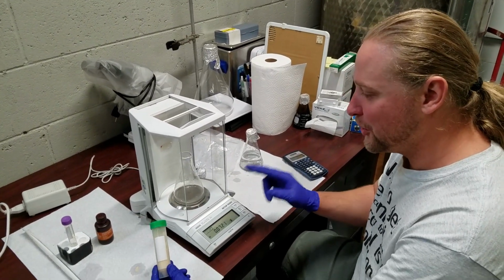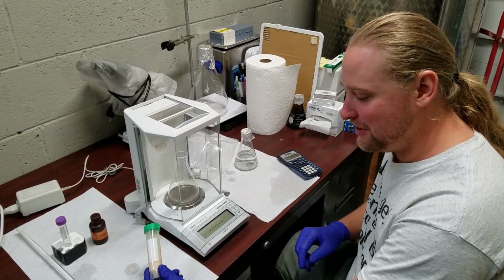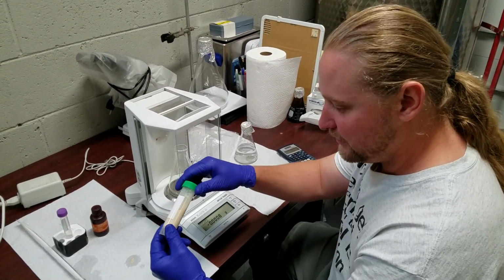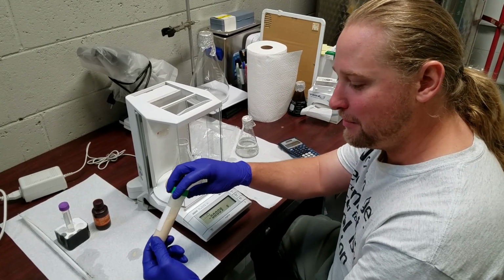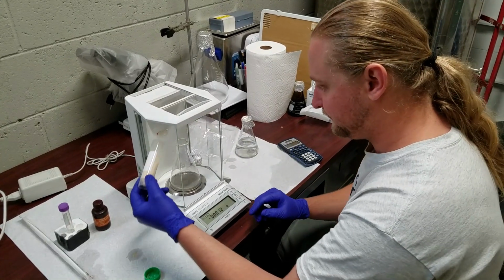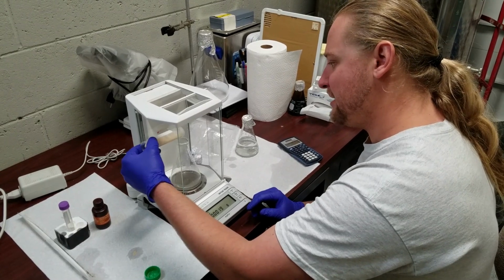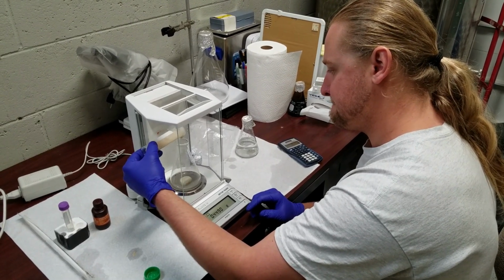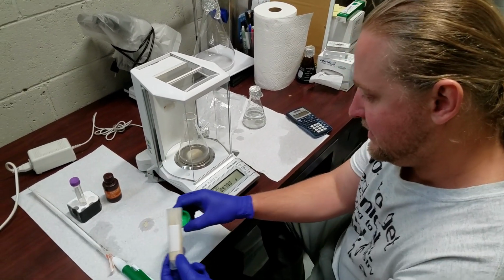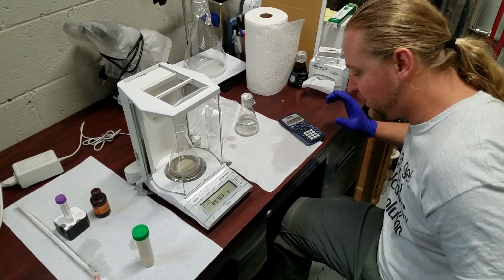So you're going to want to put your Erlenmeyer flask on your balance. Tare your balance to 0. Here we have our uniform sample of our yeast. We're going to pour it by weight rather than volume. You're going to have to degas the slurry and pipette it out, so that's why we like doing it by weight. I like to pour about 1 gram to 1.5 grams of slurry. In here, it looks like we've got about 0.978 grams of slurry on that beaker.